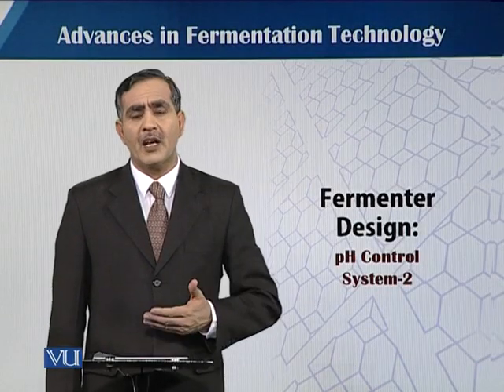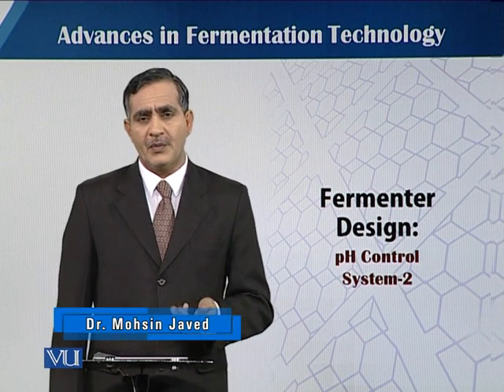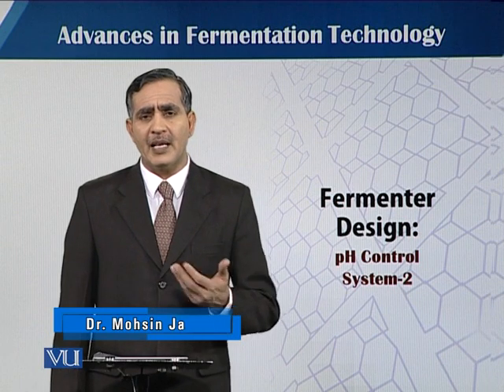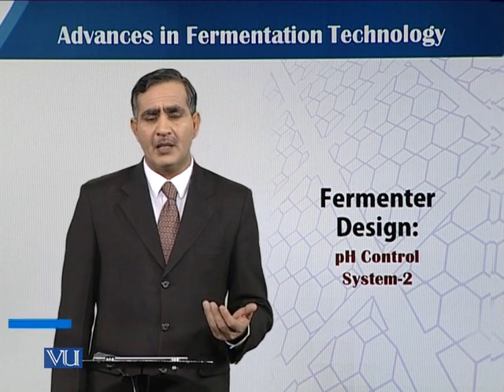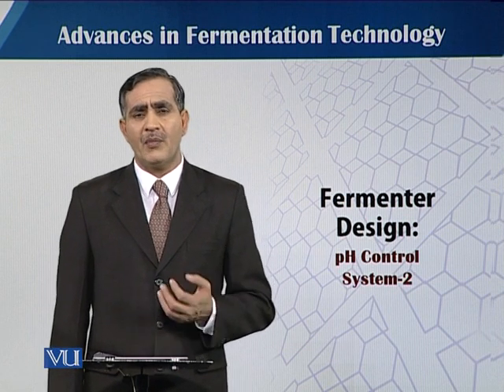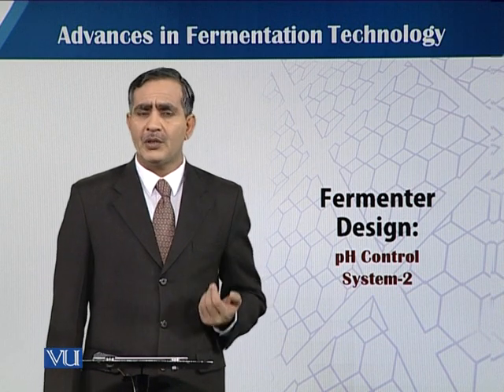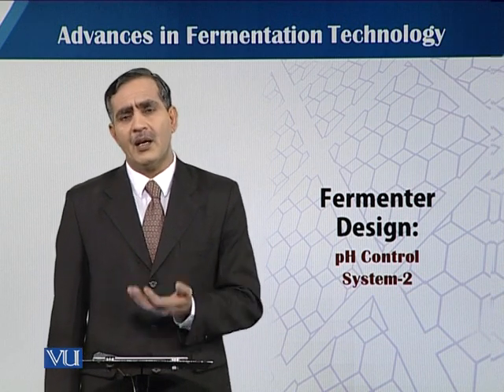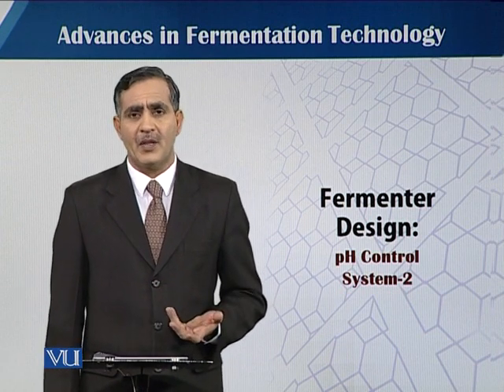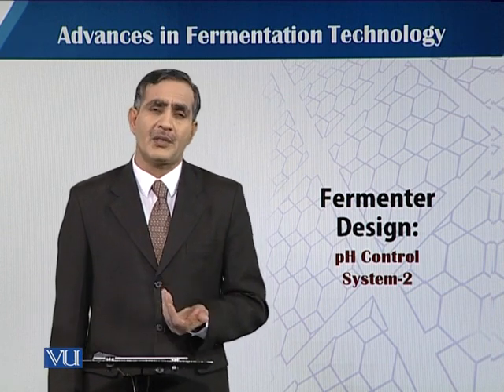In this module, we will talk about the automatic control system of pH. As we discussed in our previous module, what kind of neutralizing agent, meaning acid solution or alkali solution, they should be, and what their concentration should be. We cannot use a diluted or a highly concentrated material, so there is a limitation. So if we have a choice, how do we control it with an automatic control system?